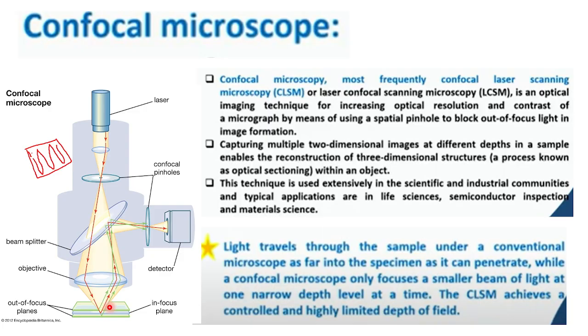Now is it clear why I need pinholes, what the detector is, and how I can get the 3D data, the 3D image? So that is the importance of pinholes, to make a high contrast. Otherwise, I will get less contrast in my image.